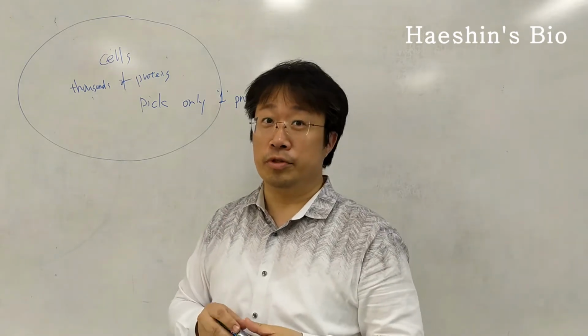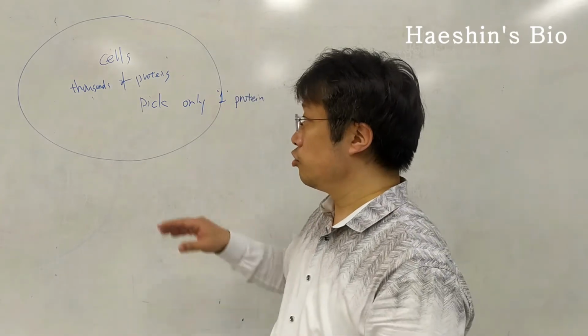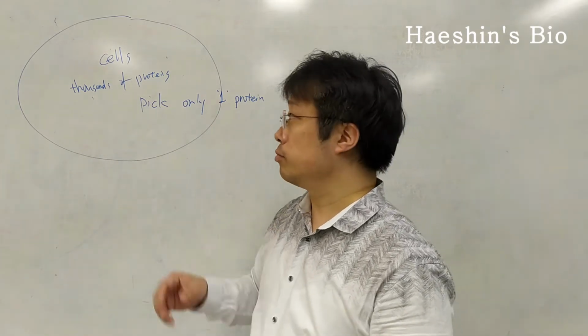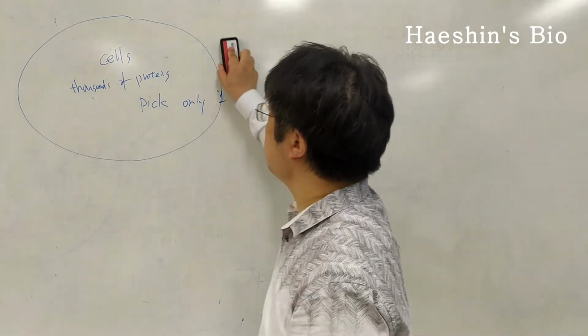So protein purification in chemical biology is the most important technique to learn for understanding the basics of chemical biology. So we want to talk about some protein purifications. This is the introduction.